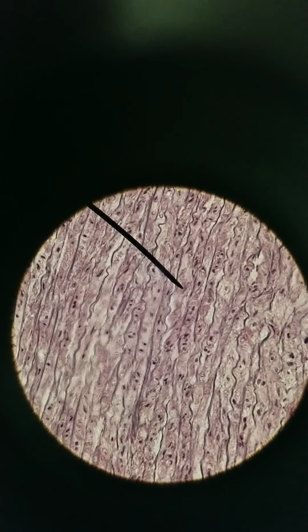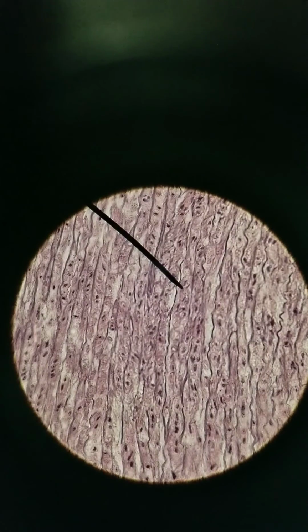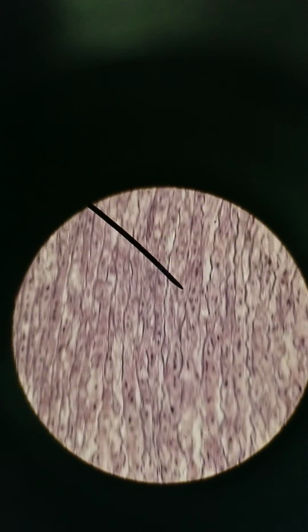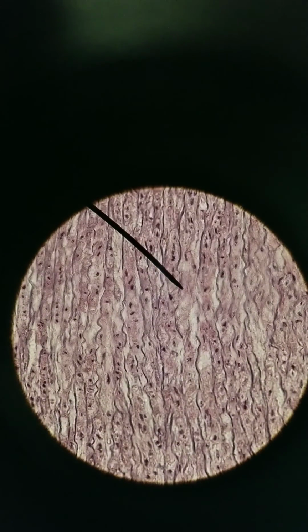So what we need here is elastic fiber. And you can see all those elastic fibers in a single direction to help withstand that pressure coming from the heart. This is elastic connective tissue found in the aorta and other places that need to stretch out. Again, all the fibers are going in pretty much the same direction, but they're much more squiggly, much more coiled than what we see for dense regular. So those are our connective tissue propers, plus mesenchyme, our embryonic connective tissue. In other videos, we'll go over the other connective tissue types.